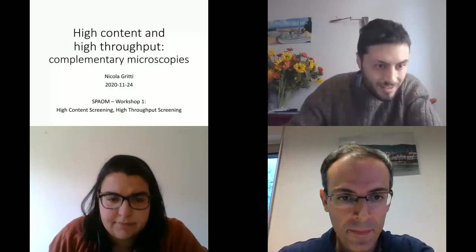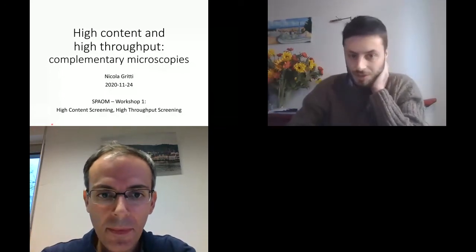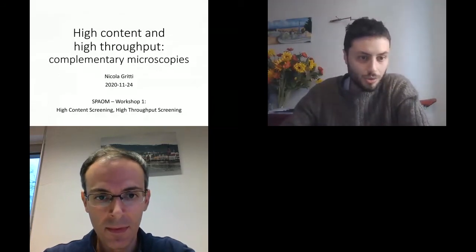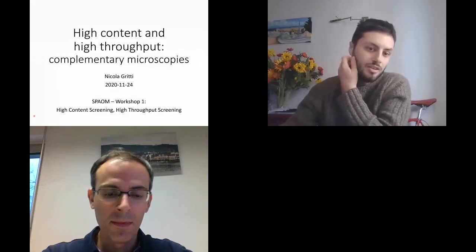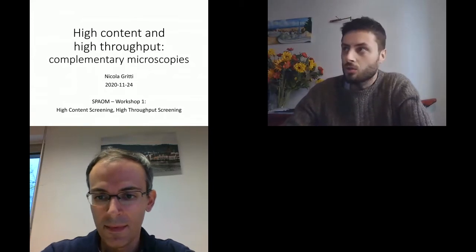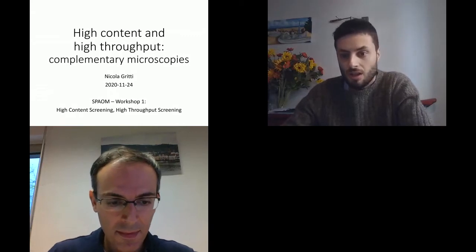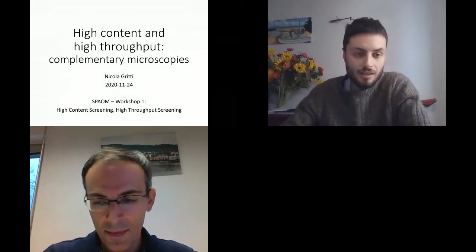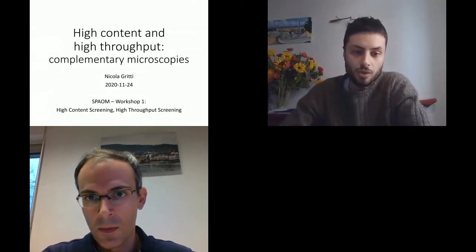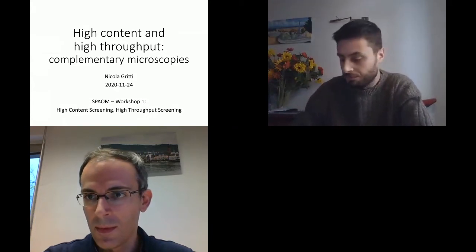Yes, perfectly. Good. So hello everybody, and thanks for the introduction, and thanks of course to the organizers for inviting us to share our idea of high content and high throughput screening. What I would like to talk about today are two approaches to perform high content and high throughput imaging. One is the more established and present application of HCS, and another one is, in our opinion, the future, moving towards more high throughput, high content microscopy.